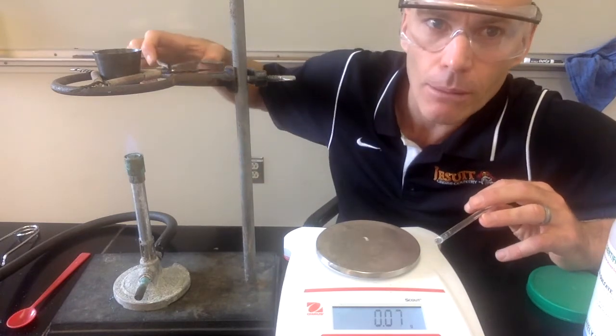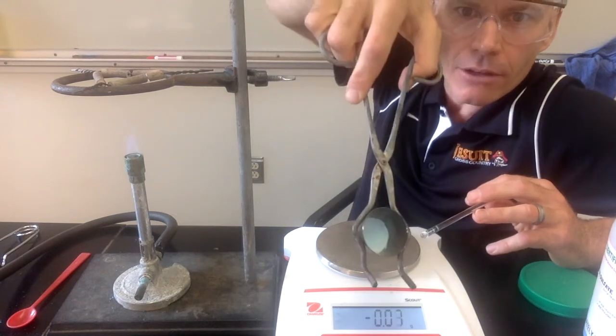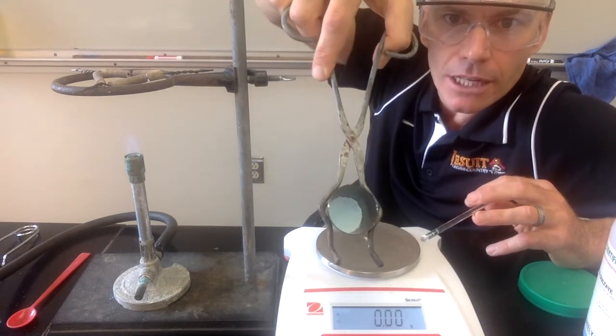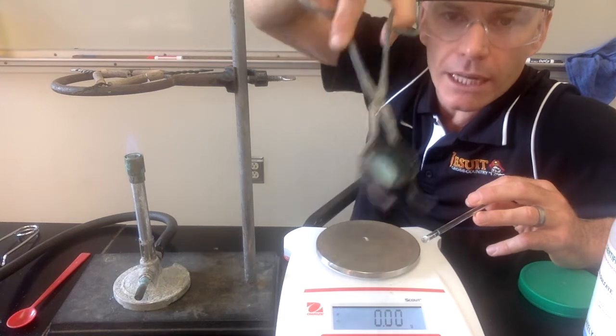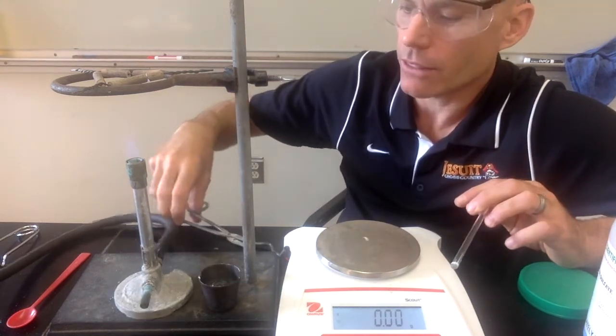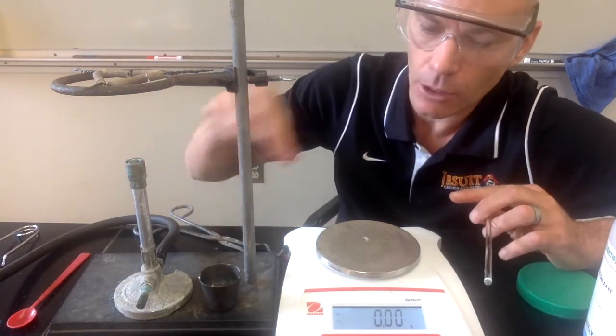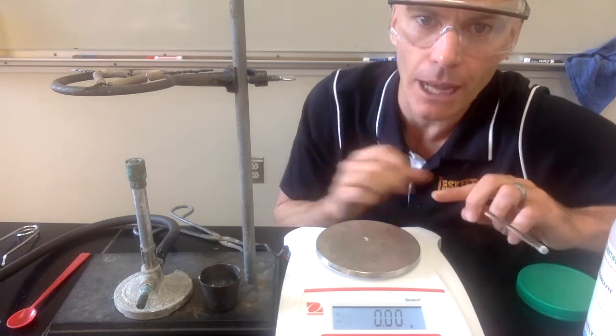We've been heating it for about three or four minutes now, and I think it's probably heated enough. If we look at the color, you can see it's no longer bright blue — it's now a dull gray, almost white color. I'm going to set it down and let it cool. We don't want to put hot things on our balance, so we'll let it cool for a few minutes. Once it's cool enough to touch, I'll put it on the balance and find its final mass.